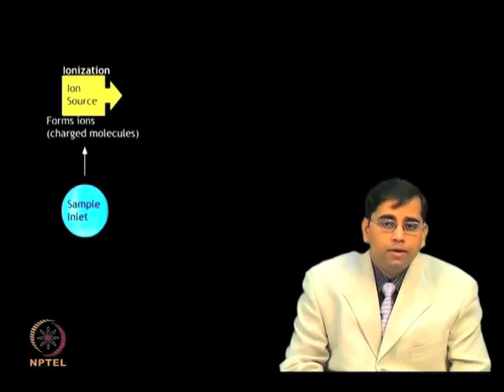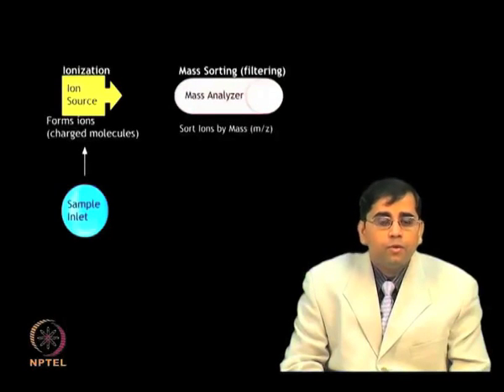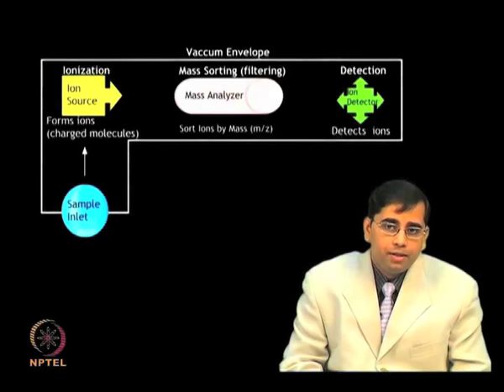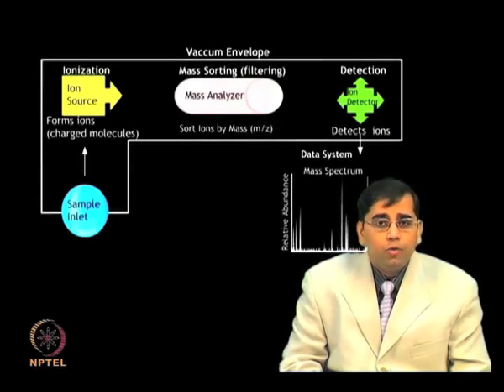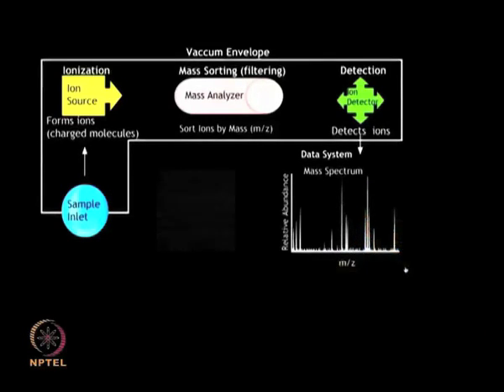The basic components of mass spectrometry involve a sample inlet to transfer the sample into the ion source, an ionization source which converts neutral sample molecules into gas phase ions, a mass analyzer to separate and analyze the mass of ionic species, a detector which measures and amplifies the ion current of mass resolved ions, and a data system to process and analyze data.